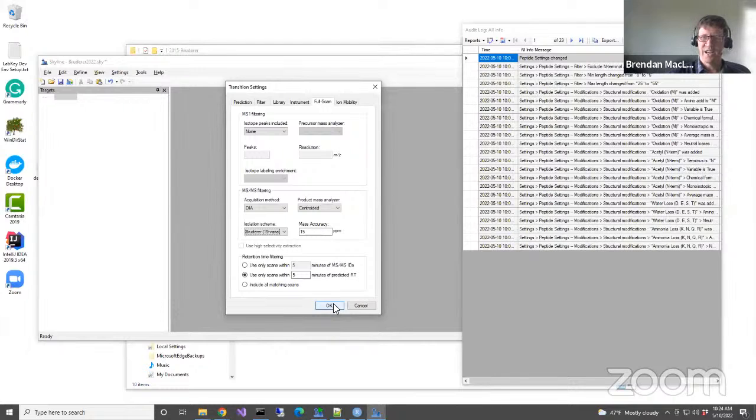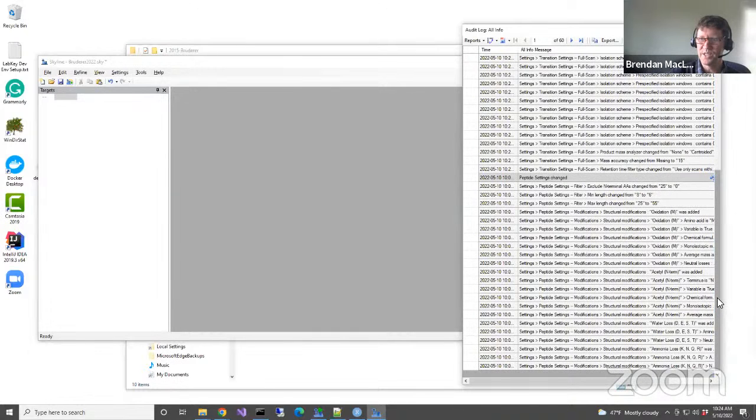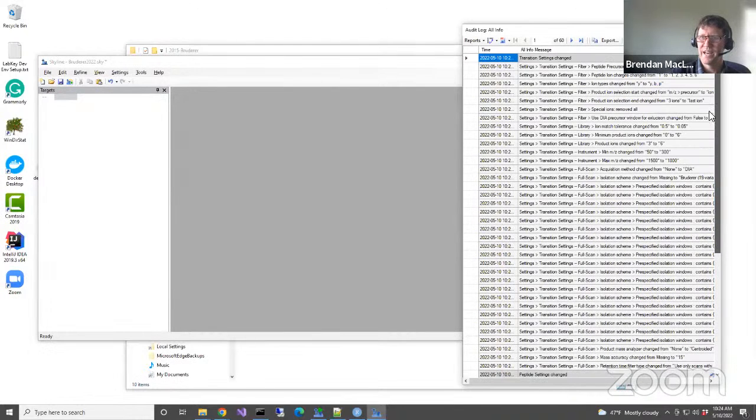All right, let's click OK. So we're done with the transition settings. So there you go. I got another more extensive entry into my audit log, with all the transition settings I changed.